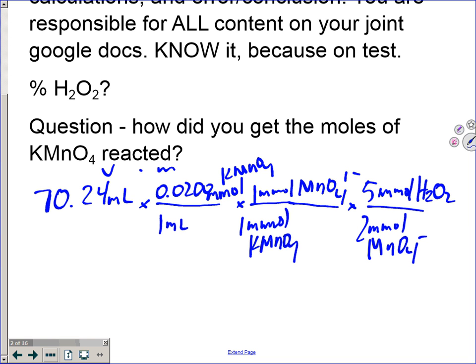Okay, this is a note to self. When we start talking about the quantities reacted, they are actually the true permanganate ion and the hydrogen peroxide inside of the solutions we had. Was the entire purple solution potassium permanganate? What else was in it? Water, right? So there's water in there, and so not all of that volume is actually potassium permanganate. There's a lot of water in there as well. And not all of the volume of the hydrogen peroxide used is hydrogen peroxide. What else is in that solution? Water. So we have to differentiate the mass of the solution versus the mass of the actual hydrogen peroxide in the solution that reacted. So that's kind of what we're doing here with this mole ratio.